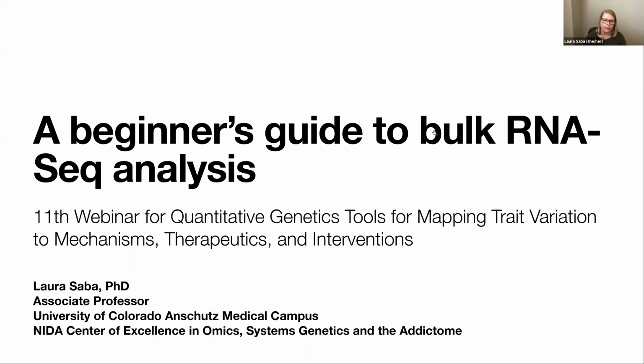So this is a big beginner's guide to RNA-seq analysis. I'm going to go over some of the tools and the procedures that we use in our lab and what our experience has been over the few years. I'm not going to give a big in-depth comparison of different methods for doing this, but instead show you what we use and tell you about why we think these are good tools for this.